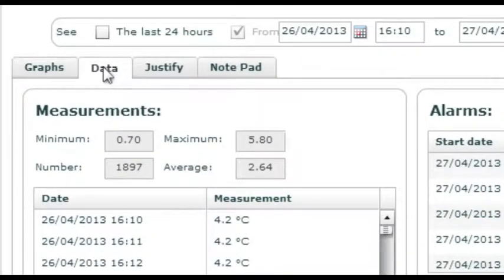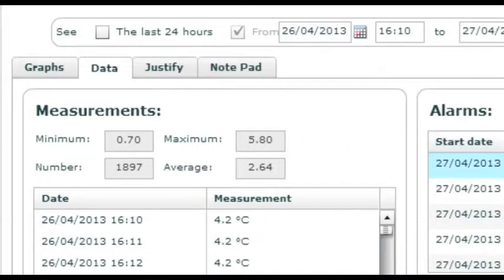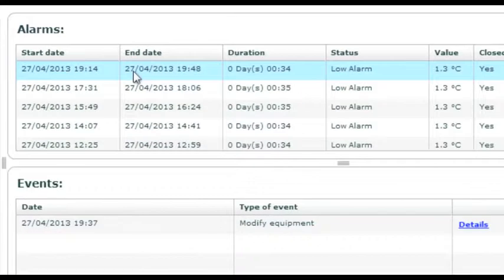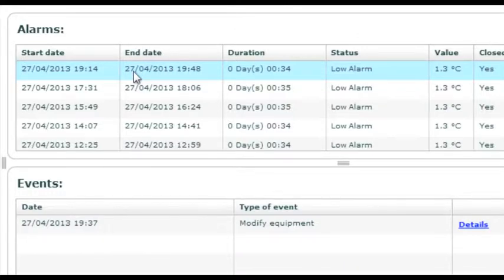We also show you the list of values with the minimum, maximum and average value. You will also find the details of all alarms that have occurred.